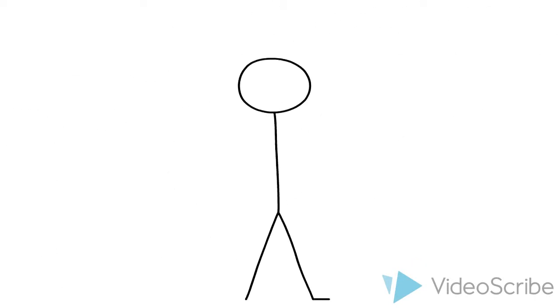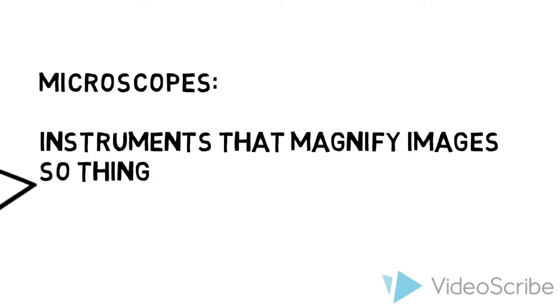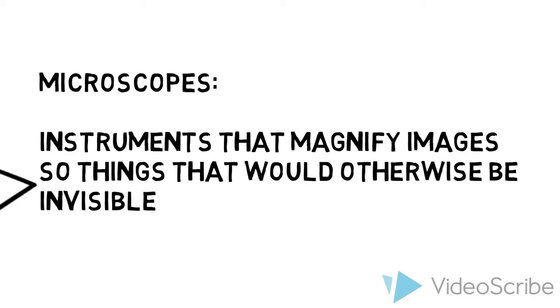So, what is a microscope? Microscopes are instruments that magnify images so things that will otherwise be invisible with the naked eye may be observed.